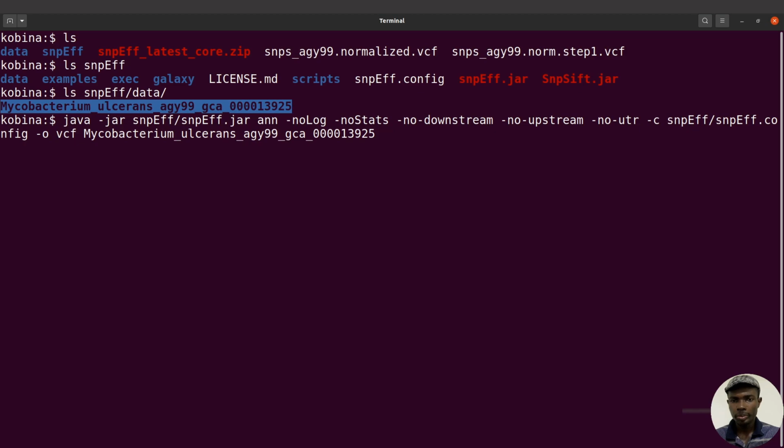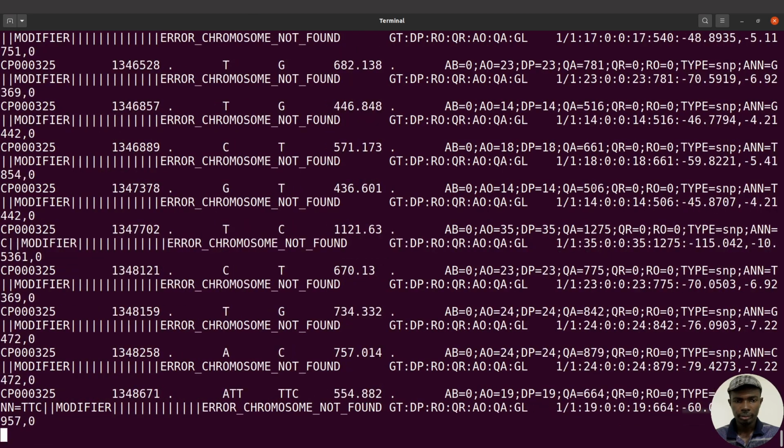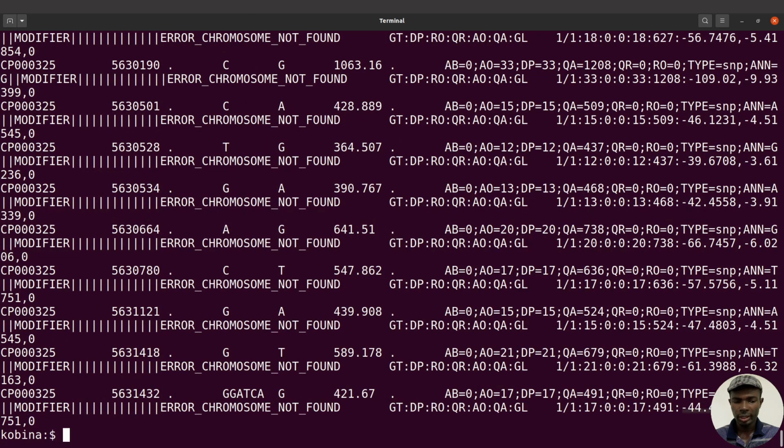And now I'm going to specify the inputs. So the input is this one here. I'll just do a copy and paste. And that is it. All right. You can also reduce the font size so that everything is on one line, and then you can review and then just revert back to the original size. All right. So this is the final command. So let's execute this command. Okay, so snpEff is doing its work now, so we can proceed. Okay, so it has been done.